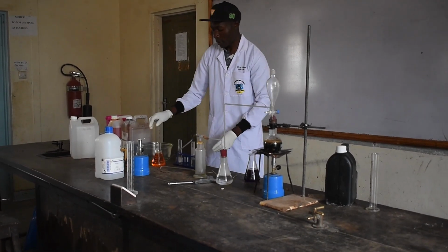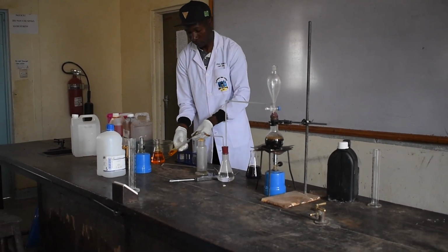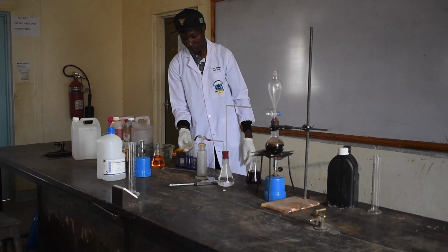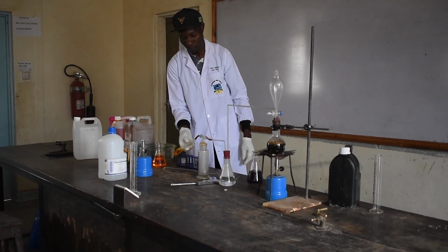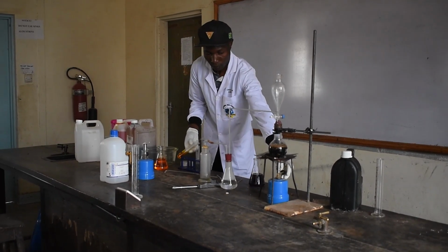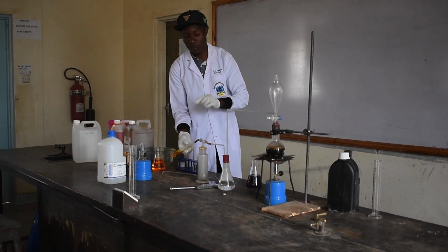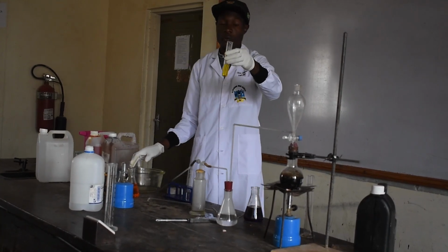Let us do it using potassium dichromate. While passing the gas through potassium dichromate, it will take a bit longer time as compared to potassium permanganate. The color of potassium dichromate changes from orange to green.